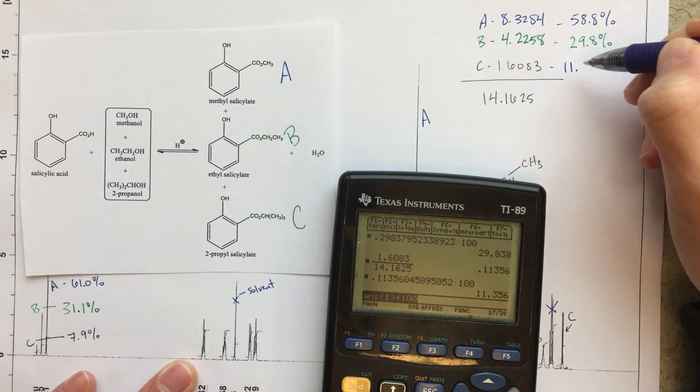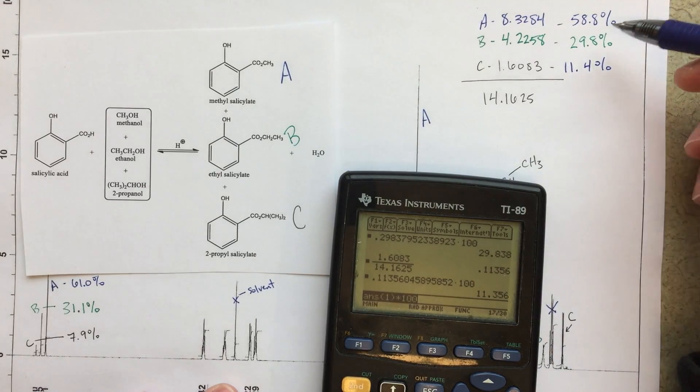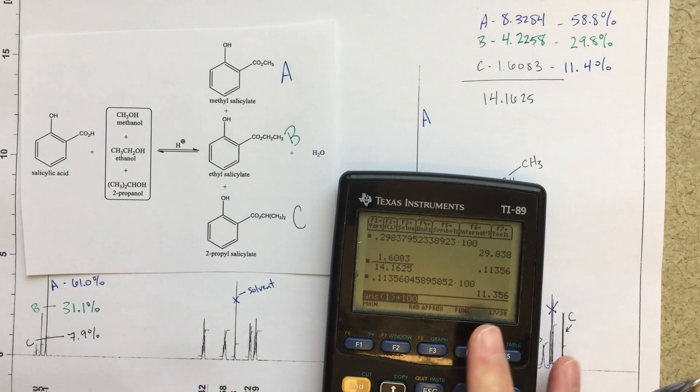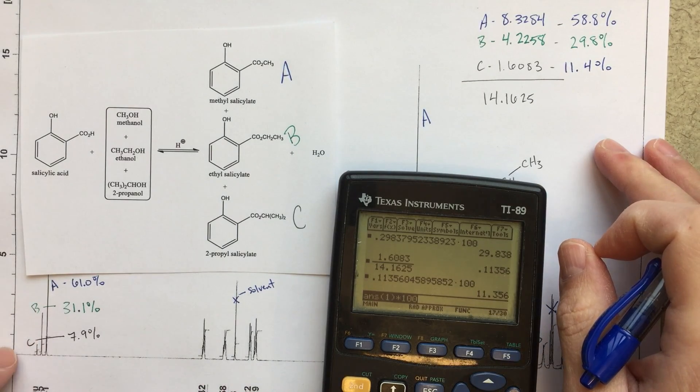And again, these should, oops, that should be in black. Oh, well. These should, again, add up to 100%. And they should be very similar to the numbers that we got over here. Now, you do see some differences, right?